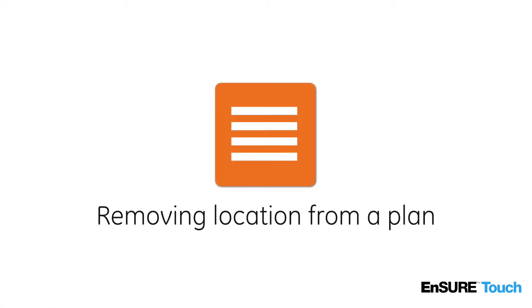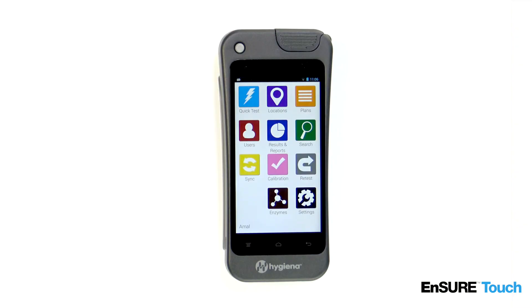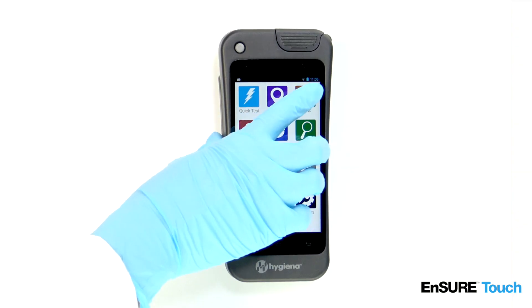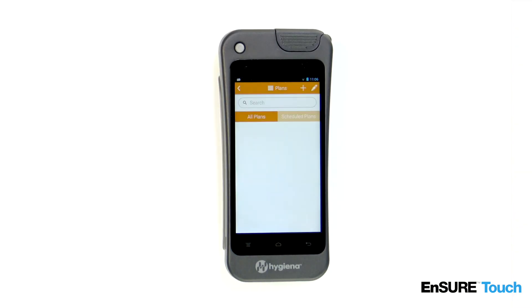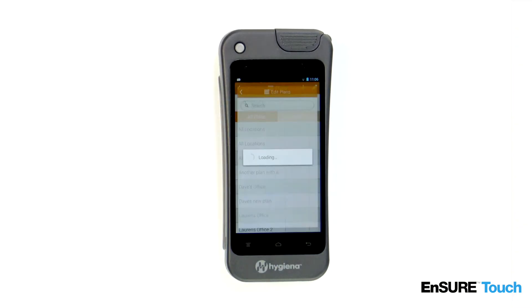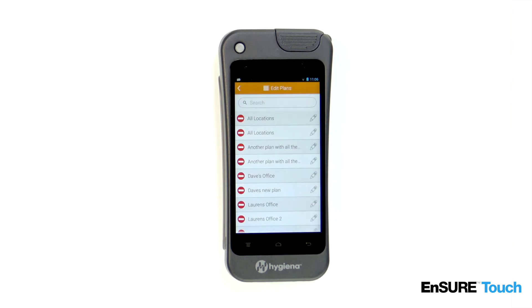To remove a location from the plan, touch the plan locations icon. Touch the edit icon that looks like a pencil. Touch the red minus icon. The location will be removed from the plan, but is still available if you wish to reuse it later.